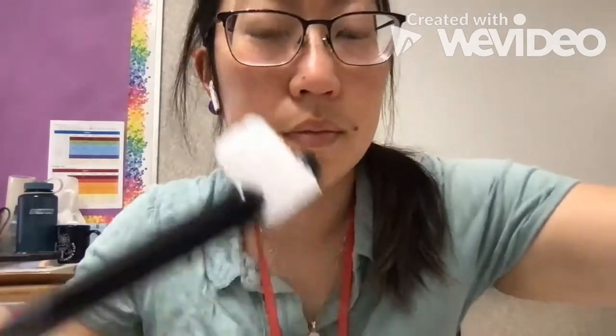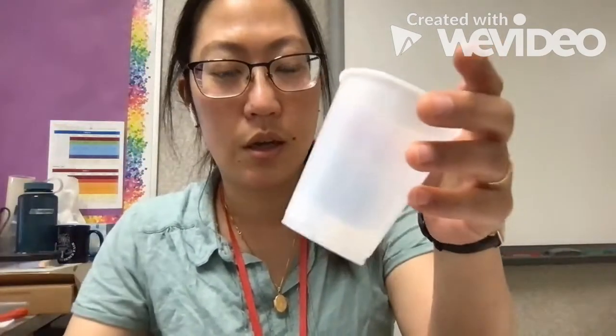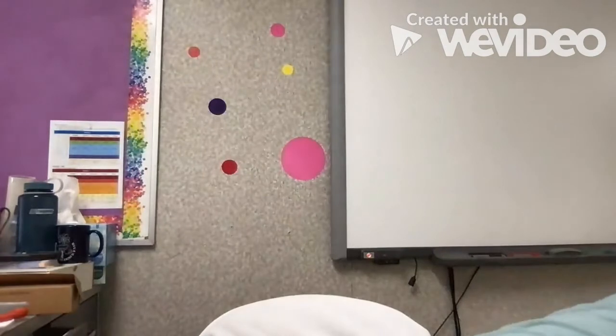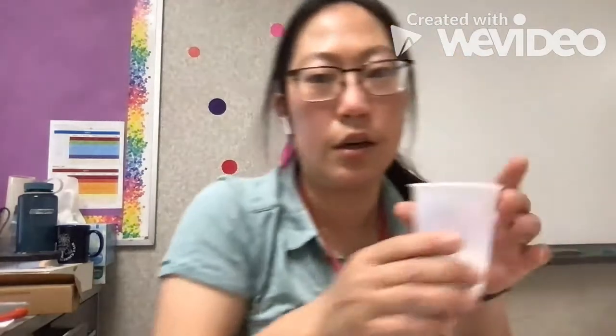Even a few seconds can damage the first layer of your skin. All right, so if I put this into a cup, if I grab a few pieces, but even with one piece, you can see that the vapor flows downwards. And you can see this if I put some more dry ice in here.